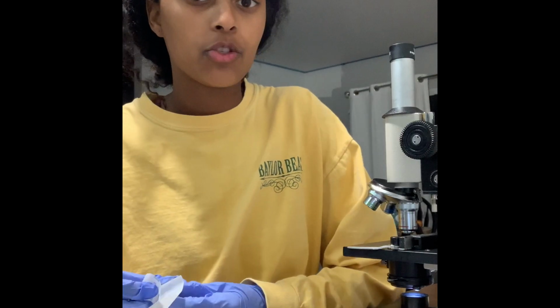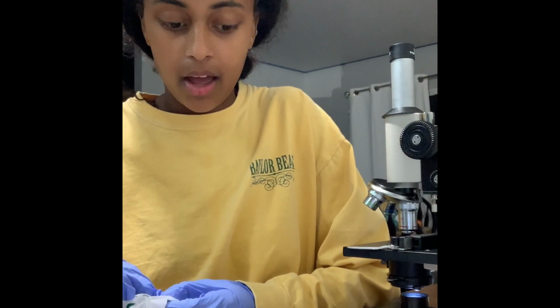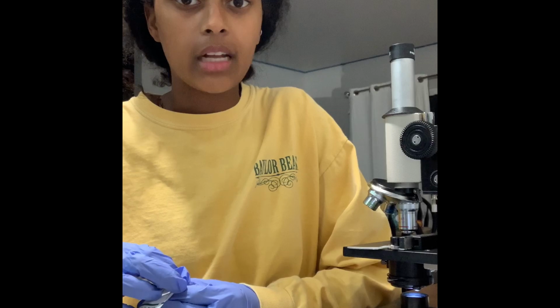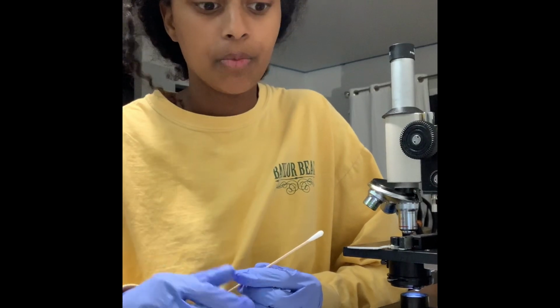It is September 22nd, and this is week 3 lab: bacterial morphology and staining techniques. Today, the first part will be using staining techniques with direct and negative stain on bacteria.